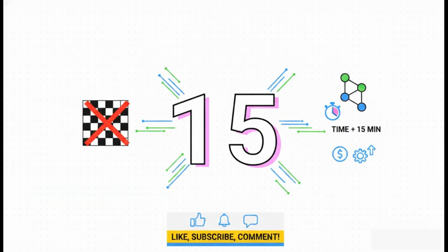To put the power of this into perspective, let's talk about the number 15. Mathematical models from our source material revealed a really powerful example. They found that you could achieve the exact same assay sensitivity using a significantly lower and much cheaper concentration of detection antibody. How? Simply by extending the incubation time by exactly 15 minutes.